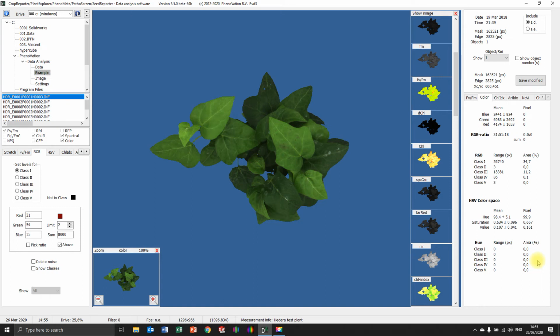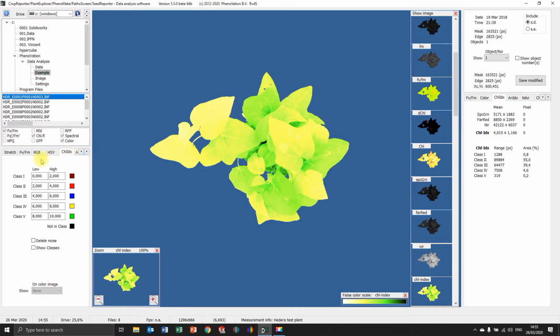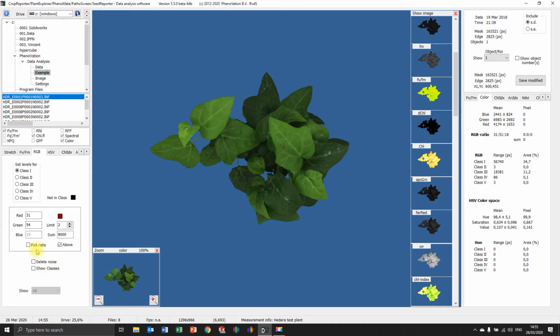This is tutorial 4, and we're going to explain something about the RGB imaging, HSV, and also the different other parameters. So to start off with RGB, we can do some RGB analysis. And the way we can do that is by working with different classes. So if you want to do an image analysis, we can do it like this.